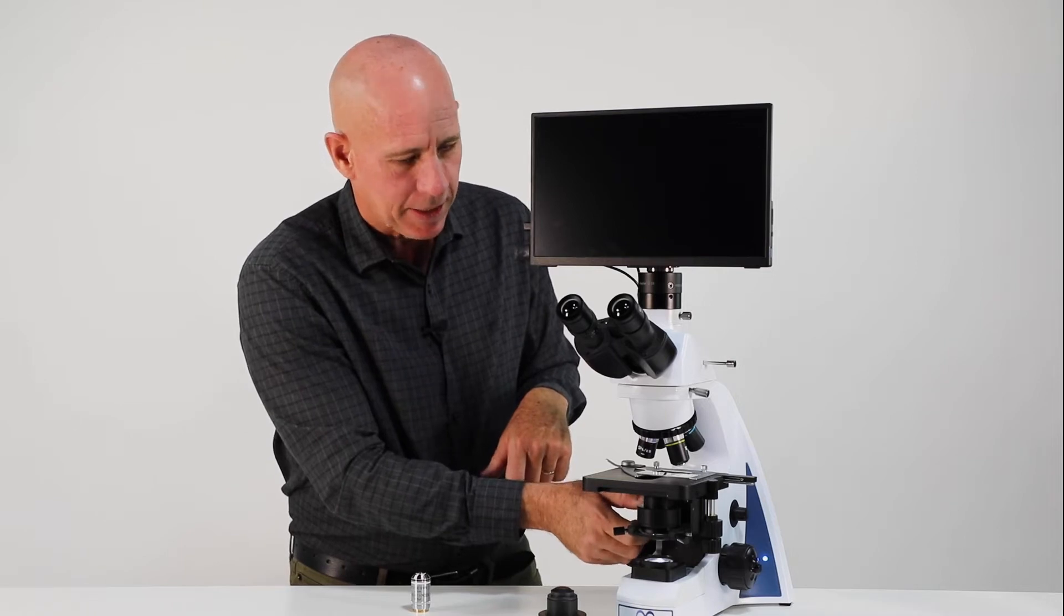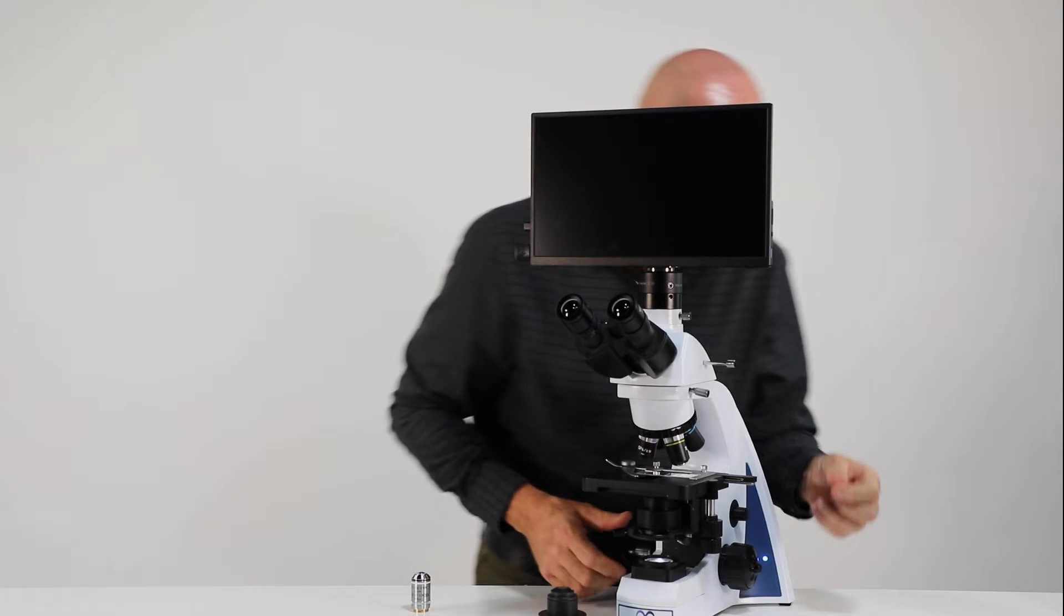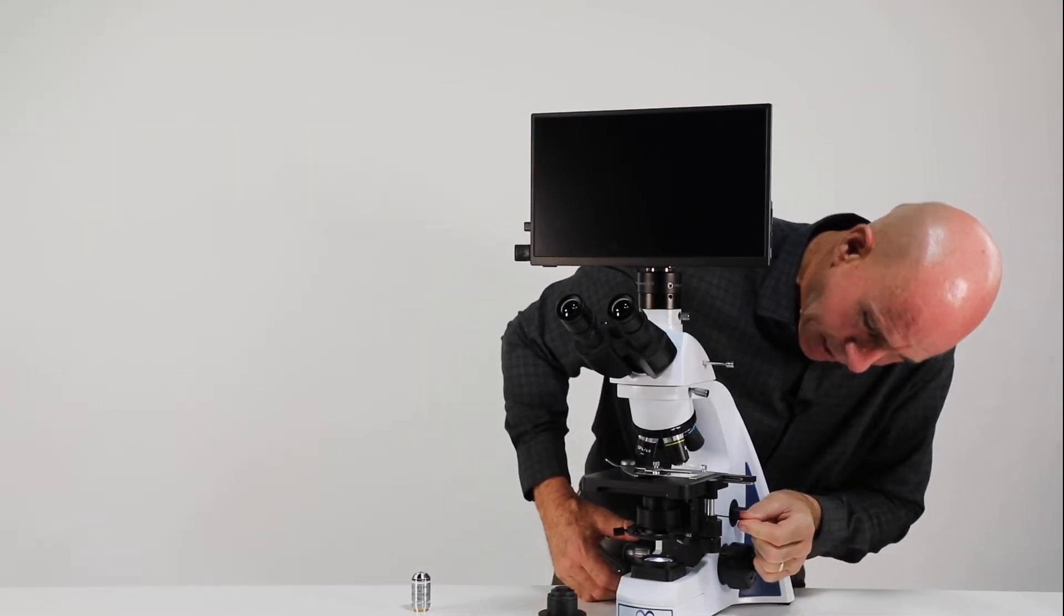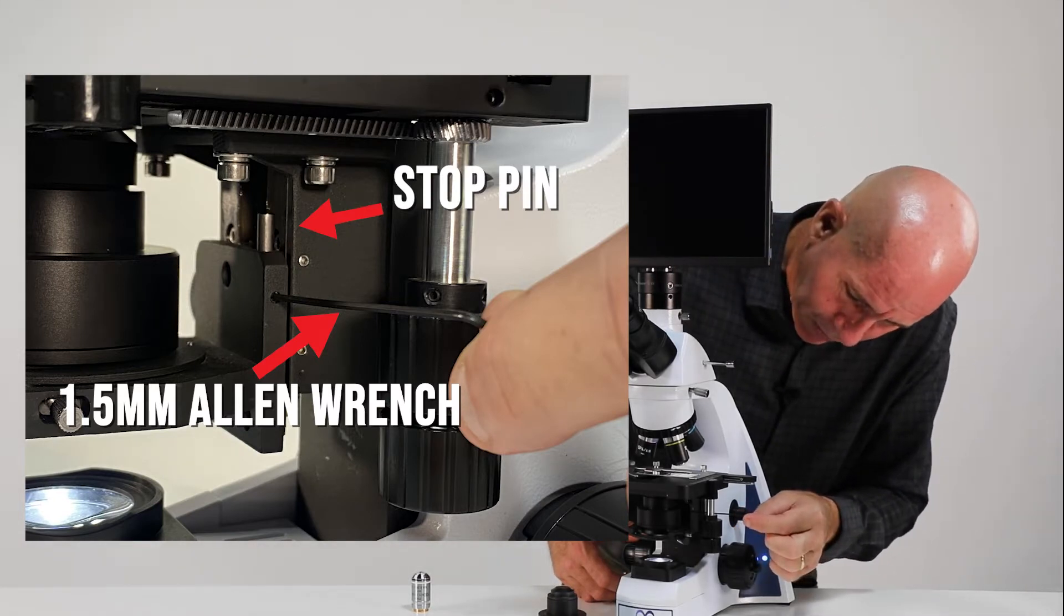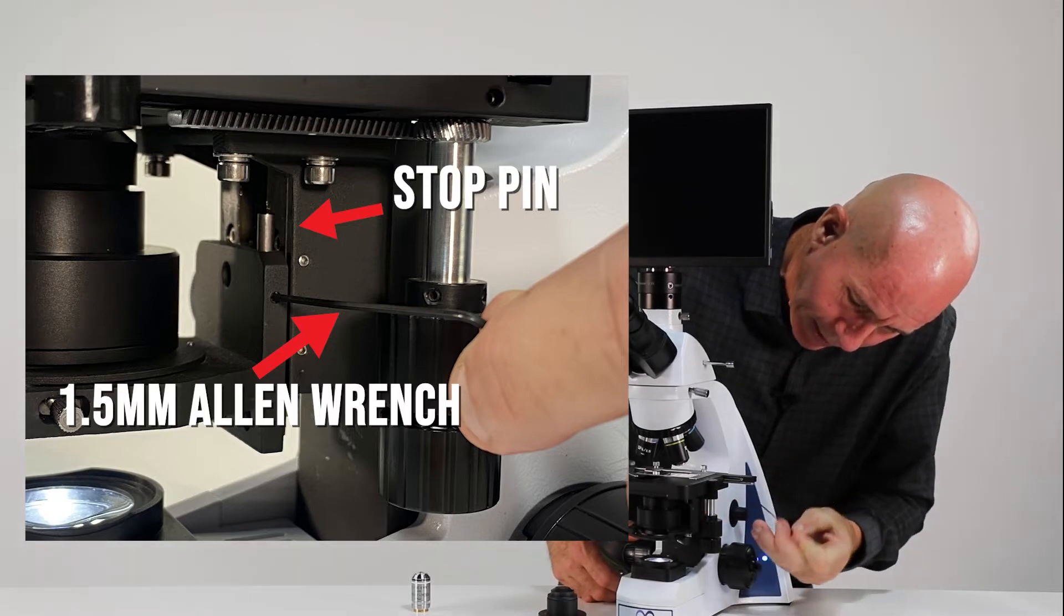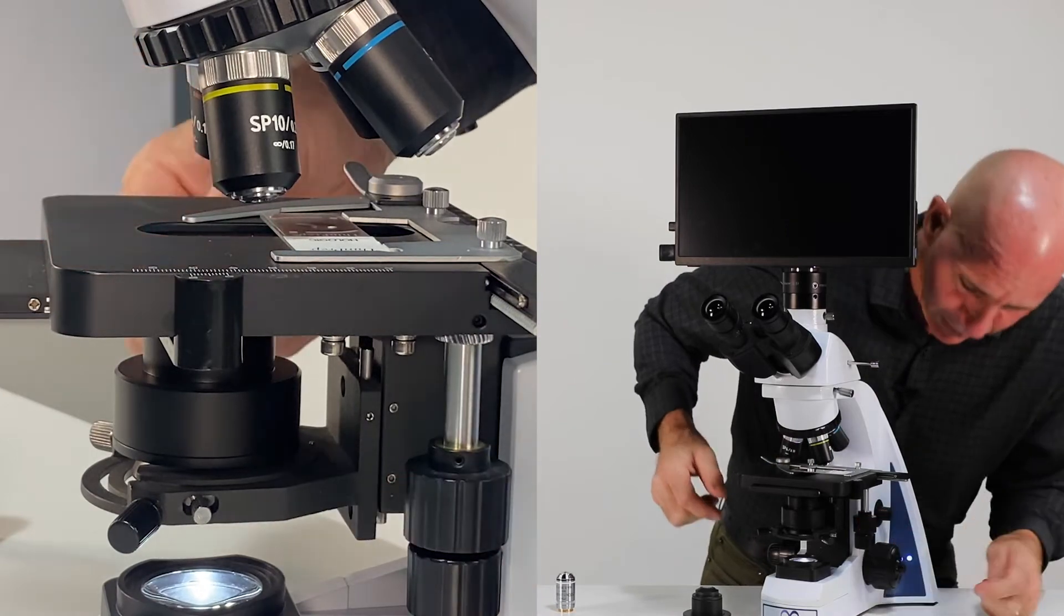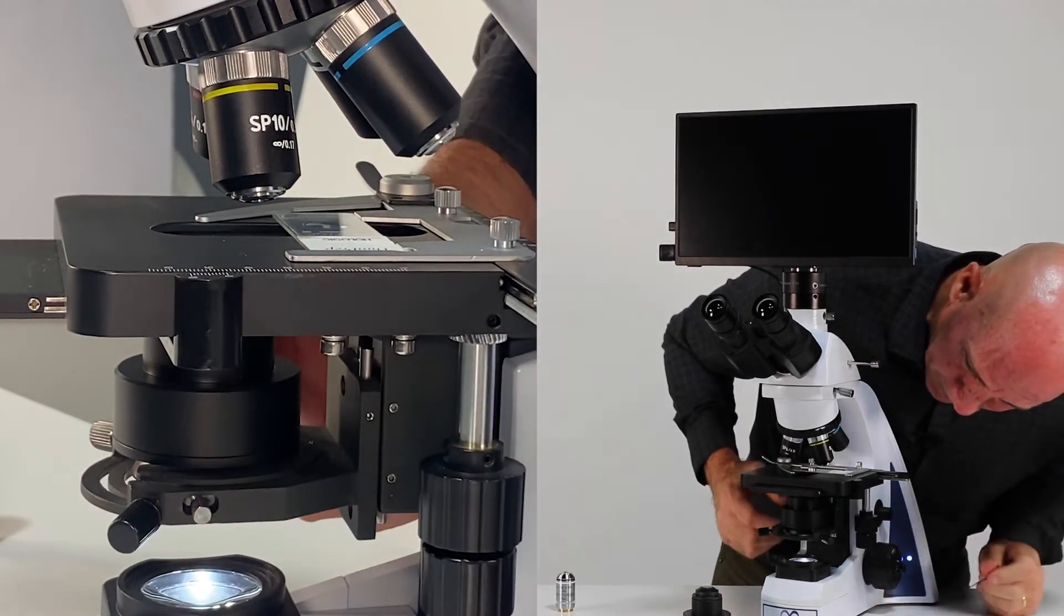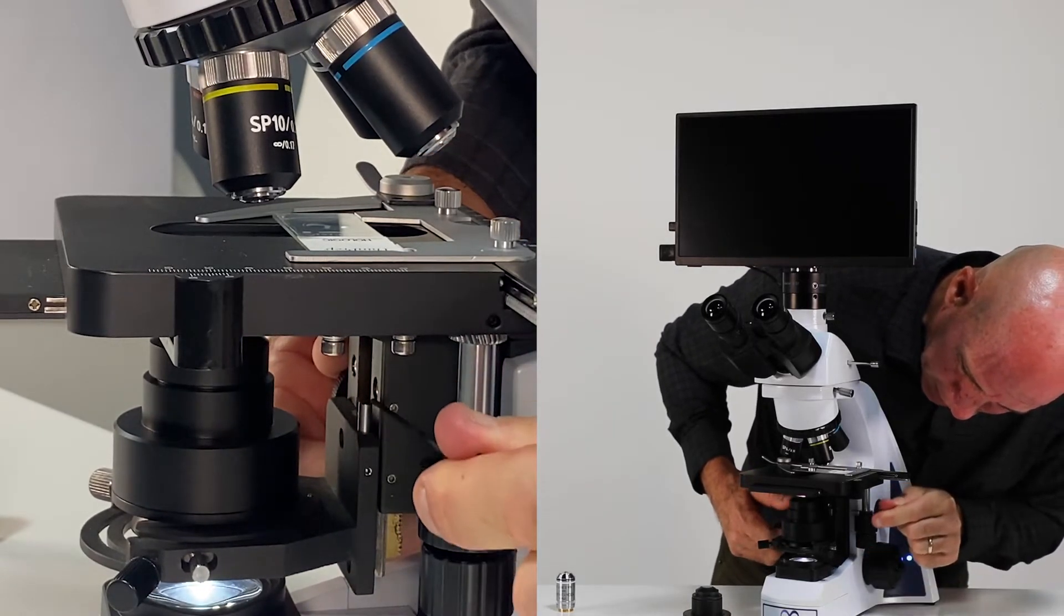But when you first set it up, you may have to make an adjustment. And it's a little tricky, a little tedious. It's a very small allen wrench. It's a 1.5 millimeter allen wrench that we're going to use. And this little bitty pin right there, let me move this so you can see it. Again, remember we have oil here, you have to be careful as you're moving around. So this little pin right there, I'm going to bring this down.